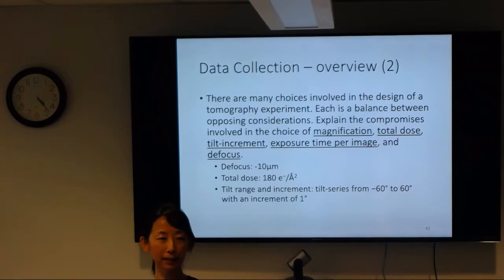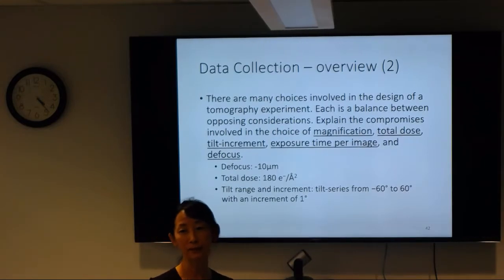Right, exactly. I'm usually a little bit more conservative. If I want to look at something at 20 angstrom, I'm probably going to divide that number by 4. Say, starting the first session, 5-ish. 3 is also good. No need to go to higher mag than that. It's just me; people have different preferences.